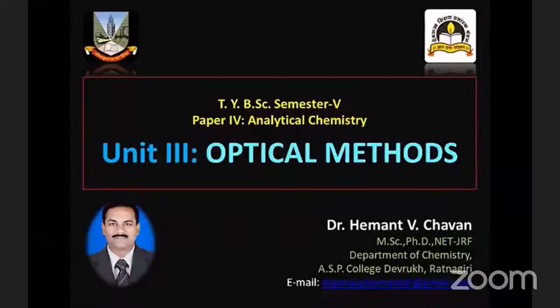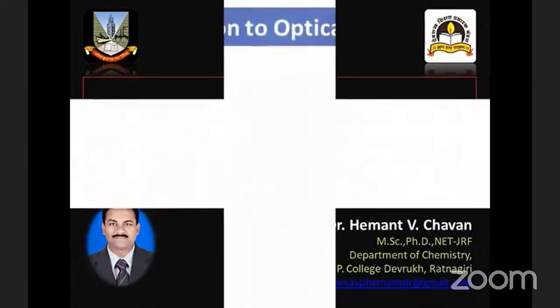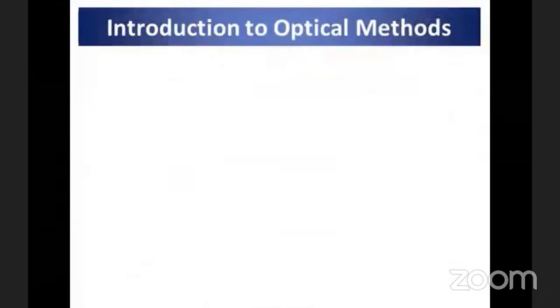Hello students. In this lecture, we are going to discuss different non-classical methods of chemical analysis based on optical properties of the sample. In the beginning, let us see the introduction about optical methods.